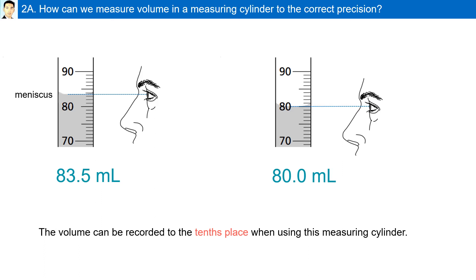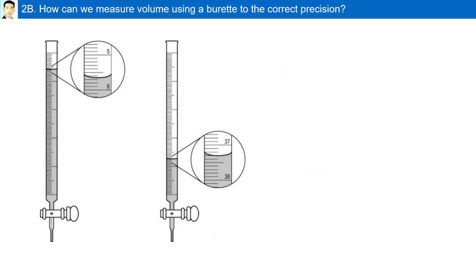The volume can be recorded to the tenth place when using this measuring cylinder. How can we measure volume using a burette to the correct precision? In a burette, a liquid is released, therefore we need to read from the top down. For example, the graduation mark is 5 and as you go down it goes to 6. In this example, the meniscus is between 5.6 and 5.7 milliliters. We can estimate one beyond 5.6; the answer is 5.65 milliliters. A misconception would be to read the volume as 6.35 milliliters — we must read from the top down, not the bottom up. This burette can measure volume to the hundredth place.